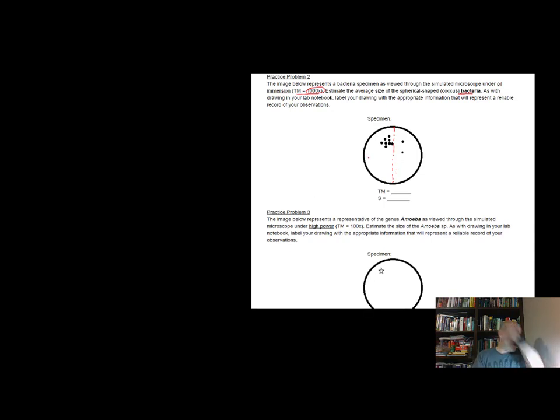It's hard enough when they're not that tiny to go all the way across, so I recommended you go halfway across. But here, I'm going to recommend that you divide half of this into 5 equal parts, and you're doing this in your mind, right? And if you do that, you're going to basically equally space 4 of them here, and that gives you 1, 2, 3, 4, 5 spaces, and then that means 5 more going this way. So what you've done is you've broken up visually into 1/10.